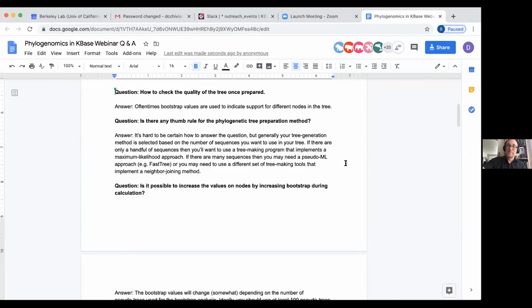And the nice thing about KBase, and part of the point, is that you can then see exactly what your parameterization was, and it's easy to go back and look at how you did things and share with other people, and you have that self-transparency on what you did to wind up with the result you got.